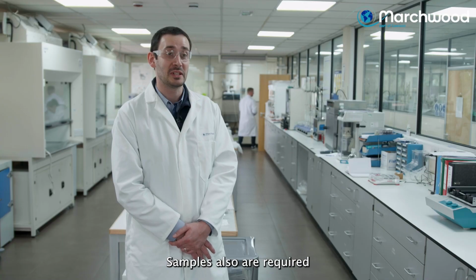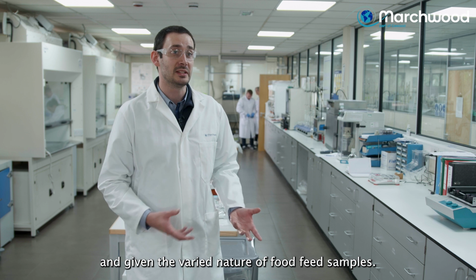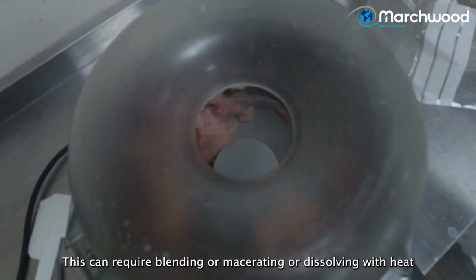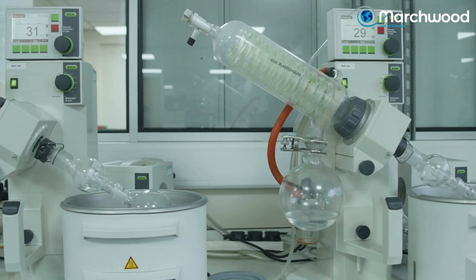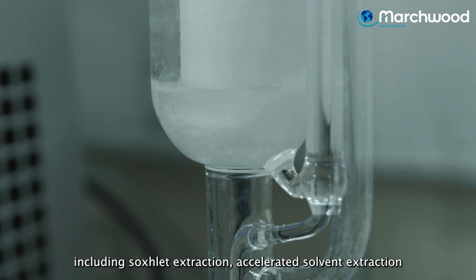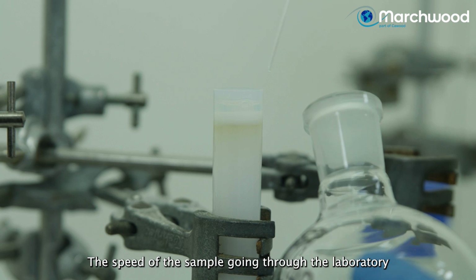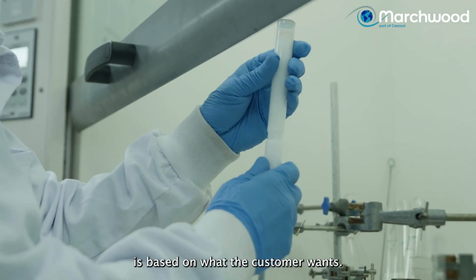Samples also are required to be homogenised upon receipt at the laboratory, and given the varied nature of food feed samples, this can require blending or macerating or dissolving with heat to make them into a consistent sample. Food feed samples are extracted using a range of techniques, including Soxhlet extraction, accelerated solvent extraction and dissolution, based on their varied nature. The speed of a sample going through the laboratory is again based on what the customer wants.